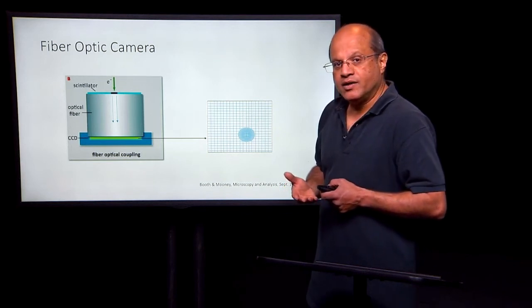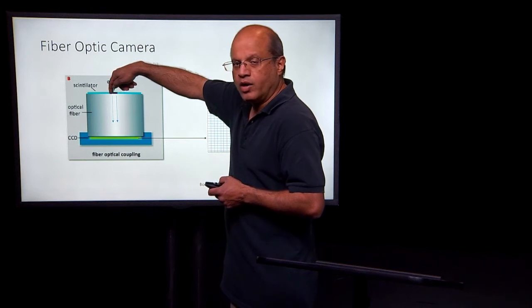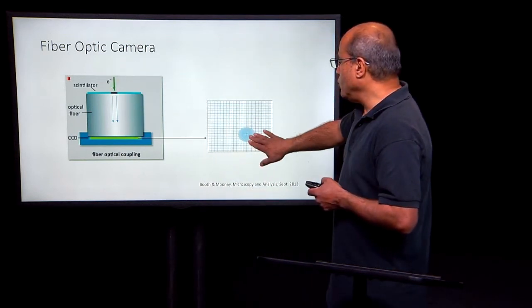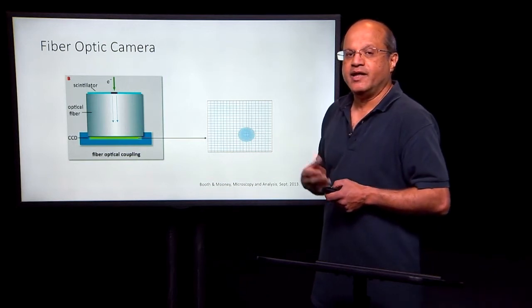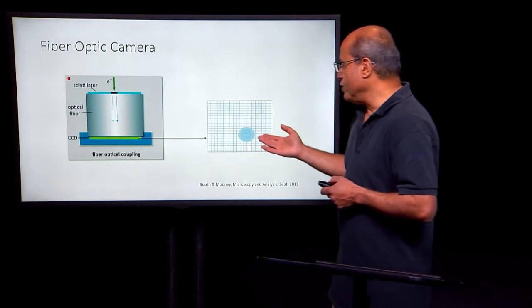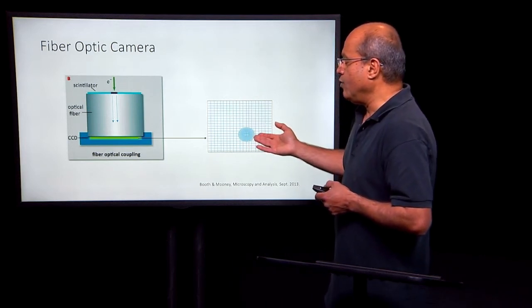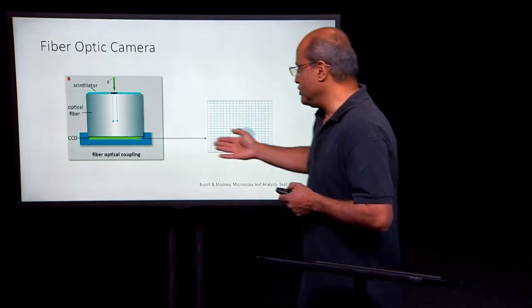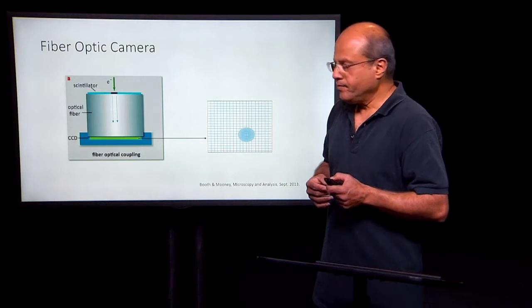But if you have a lot of signals, if you have a whole bunch of electrons hitting the scintillator more or less at the same point, what you would end up measuring is the mean over that randomness, and that mean is a deterministic signal. So that's what we usually assume. We assume that what we have is a case where we have a reasonable number of electrons so that the signal we get is a deterministic signal.